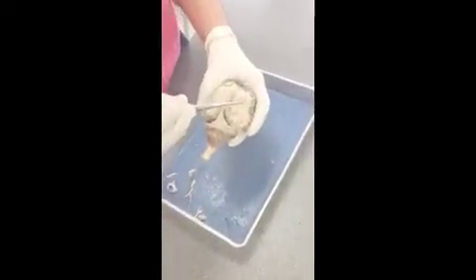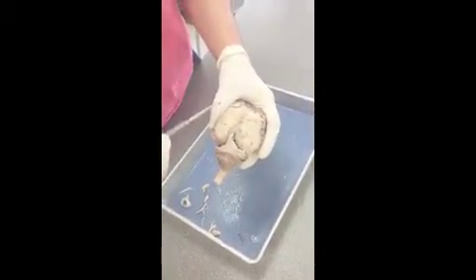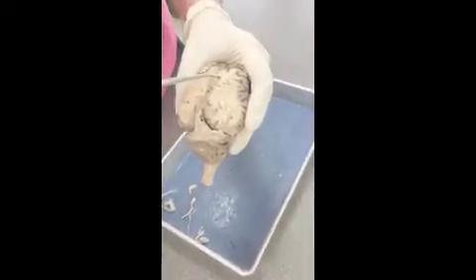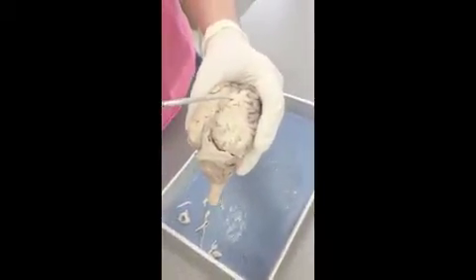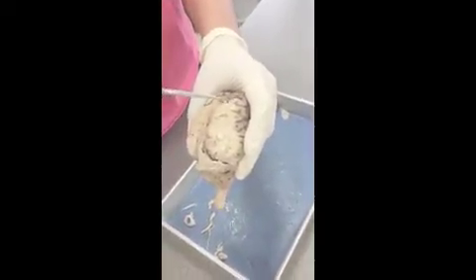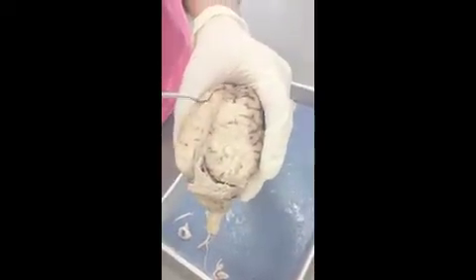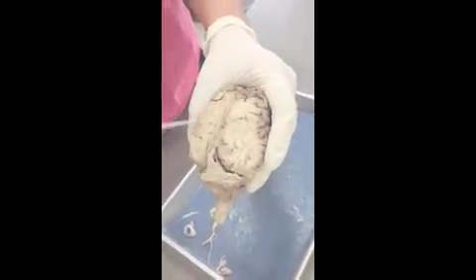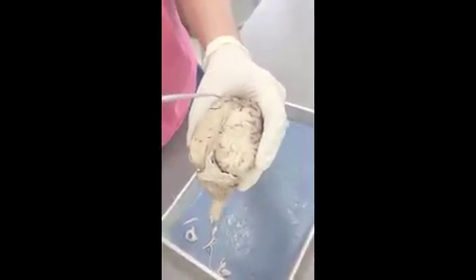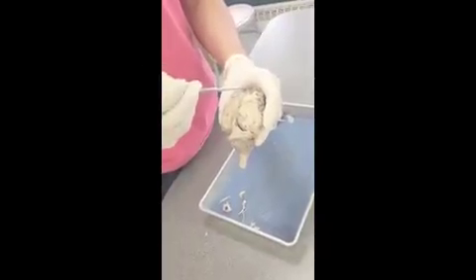This portion here is the largest part of the brain, known as the cerebrum. It's associated with thought and action. This portion is also made up of gray and white matter. These grooves here are called the sulci, and then the bumps are called the gyri, and the folding of these increases the amount of cerebral cortex that can fit in the skull. This line down the middle that separates the two hemispheres is called the longitudinal fissure.